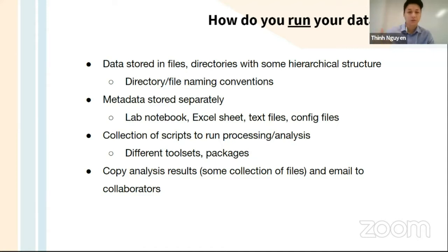And maybe there's a sequence of them, right? So you would chain your analysis in different stages. And at the end of that, once you've run through your analysis, you would have some set of files representing your analysis results. And then you store that, and you can look at that, use that to interpret your scientific results and answer your scientific questions.